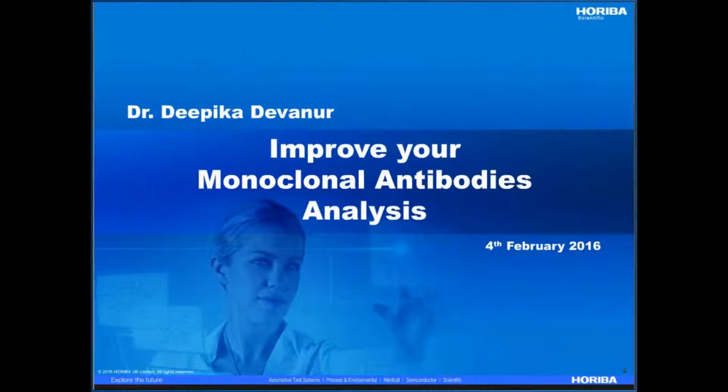Hello and welcome to this webinar. Today I'll be speaking about the analysis of the monoclonal antibodies Infliximab and Rituximab using the HPCE 512 capillary electrophoresis platform.